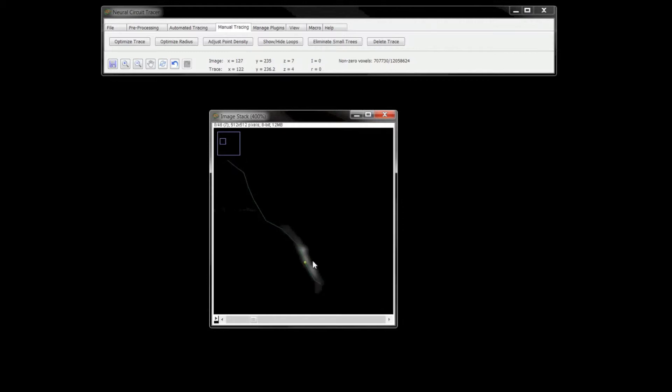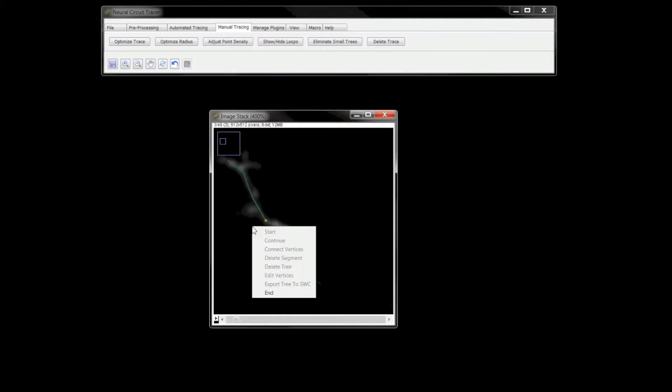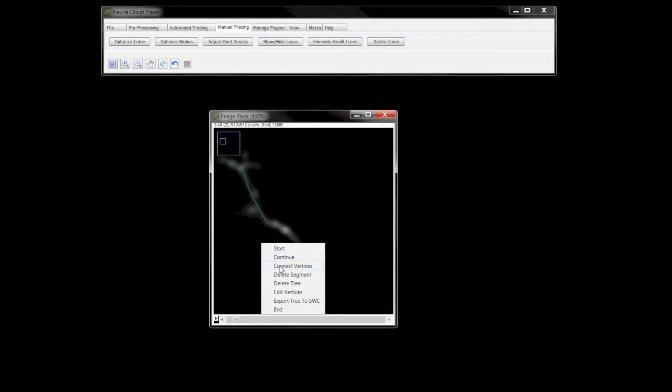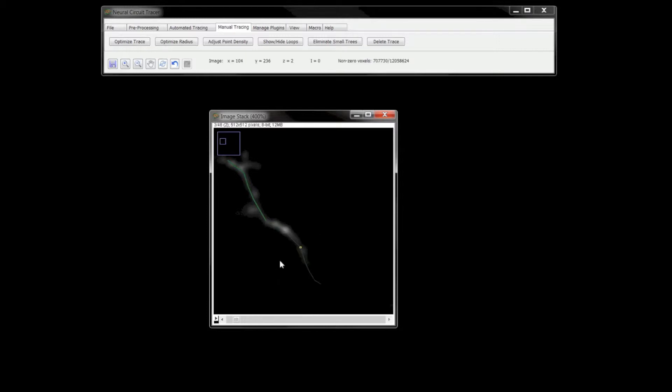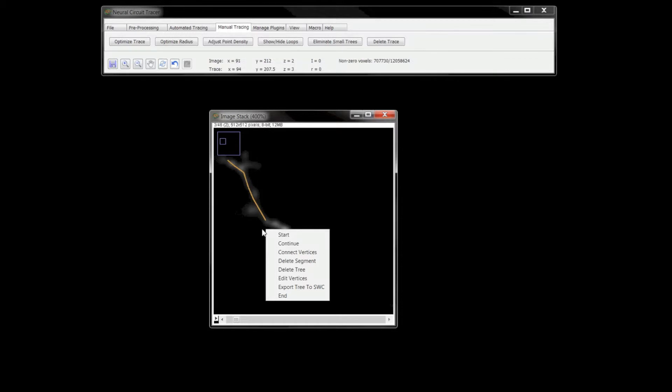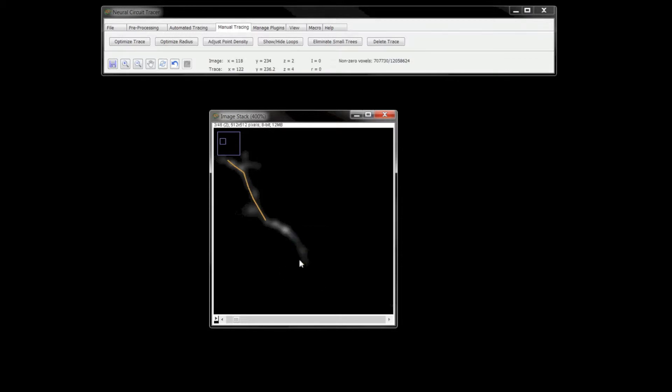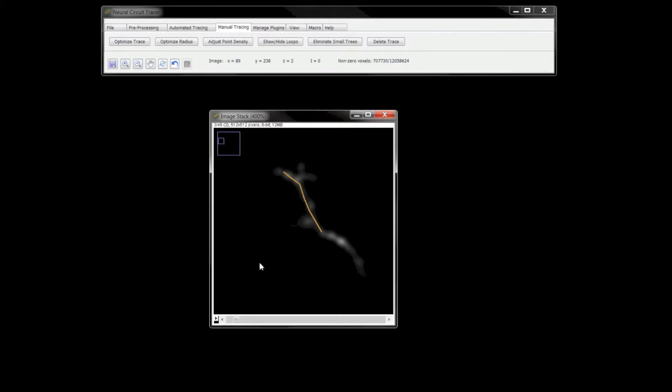I can delete connections or entire trees, and undo and redo tracing steps.